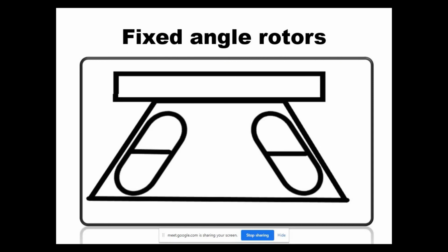In our department, we do not have the swinging bucket rotors. We have only the fixed angle rotors, because most of the things we can do here, as we don't do density gradient centrifugation. But if you want to do density gradient centrifugation, that is ultracentrifugation, you will have to go to the Guwahati Biotech Park. There the ultracentrifuge machine has swinging bucket rotors.